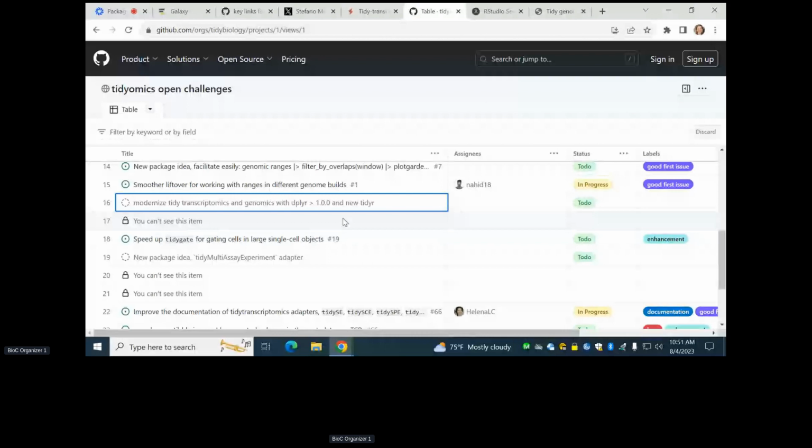Yeah, if I could add. On the efficiency, for many things in exploratory data analysis, it's very fast. You won't experience any difference. We're not hiding anything. If you go to the open issues, many of them are like speed up this, speed up that. In plyranges, if there are many groups, like thousands of groups, certain operations can be slow. You'll see that on the open issues, and we're working on it. But for many exploratory and interactive analyses, plotting, all the things that Stefano showed, you're not going to experience a difference in speed. All the optimization, as Michael said, is on top. So pick one place. If you are a software engineer, those are the challenges that are for you.